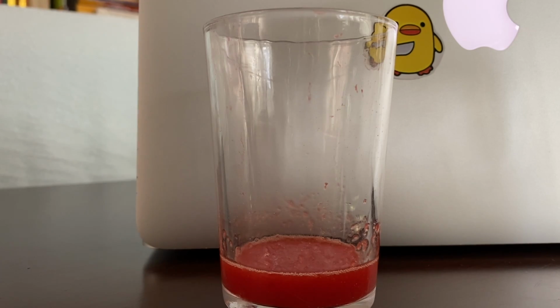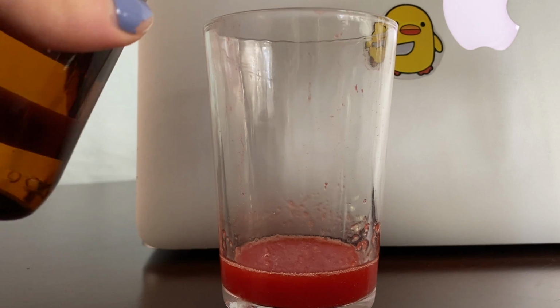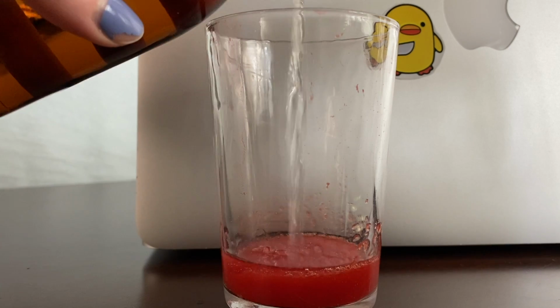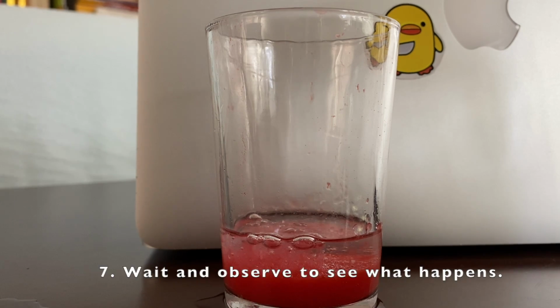Now that we have all the juice filtered, we're gonna add the rubbing alcohol. The amount should be the same as this juice. So let's add and wait to see what happens. We can see that it's not mixing, it's in 2 different layers, and we will observe it now.